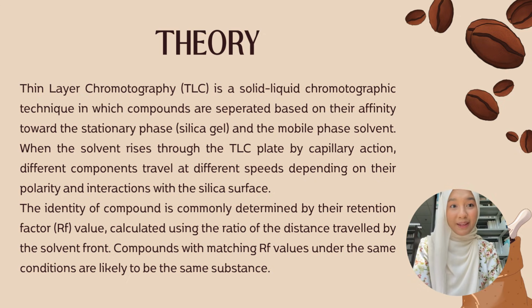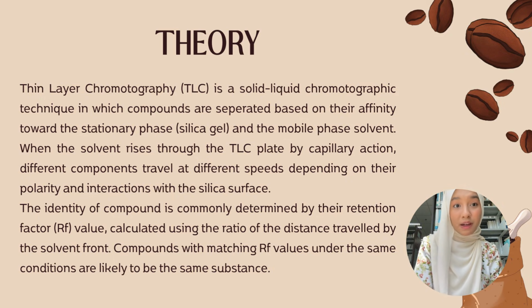products. Hi, my name is Najwa and I will talk about the theory of thin layer chromatography. Thin layer chromatography (TLC) is a solid-liquid chromatography technique in which compounds are separated based on their affinity toward the stationary phase, silica gel, and the mobile phase, the solvent. When the solvent rises through the TLC plate by capillary action, different components travel at different speeds depending on their polarity and interactions with the silica surface.